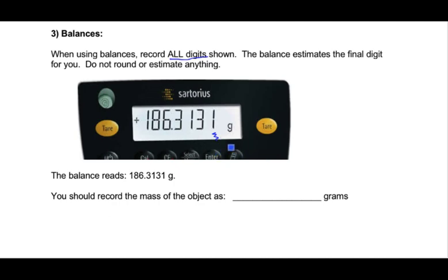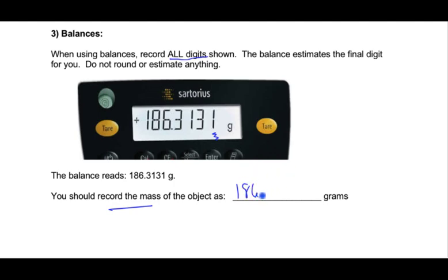You would just look on the little plaque on the balance to know what the error of that value is — usually plus or minus one or two of that unit. When you record the mass of an object, you don't stop — you actually record whatever is given on the digital balance readout. When I grade this lab, that's one of the things I'll be looking for: did you apply the proper measurement technique?